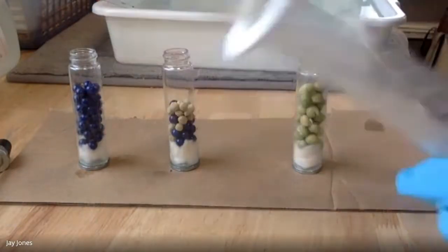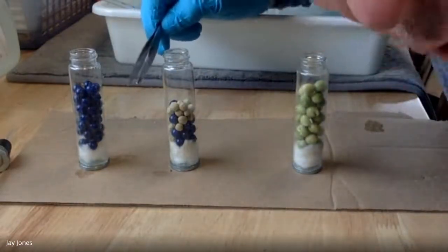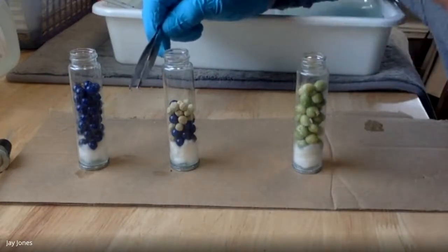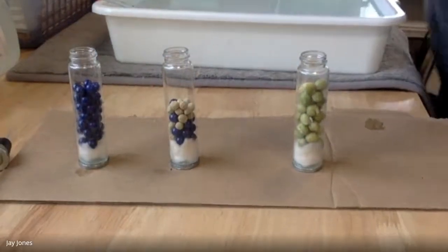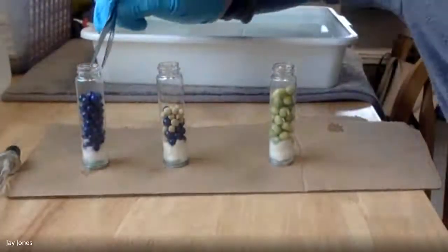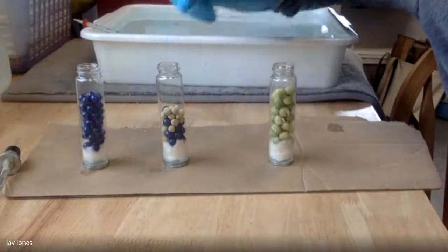Now you might be thinking, what are these beads? Well, those beads are glass. They don't do anything. They don't perform cell respiration. Glass is not living, and that's okay. We're doing that to measure changes in temperature and pressure and compare those changes to this one and this one.